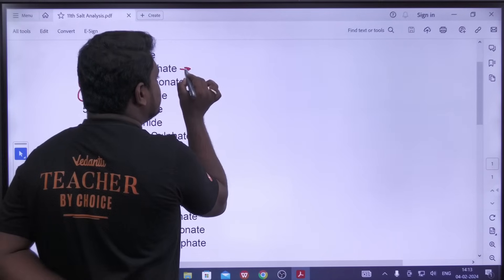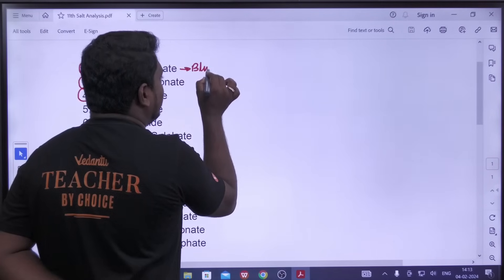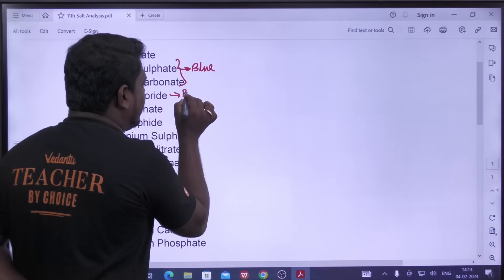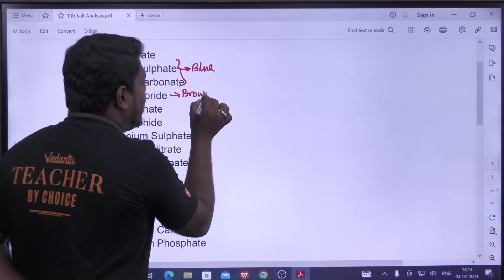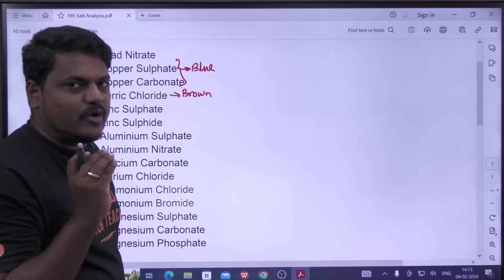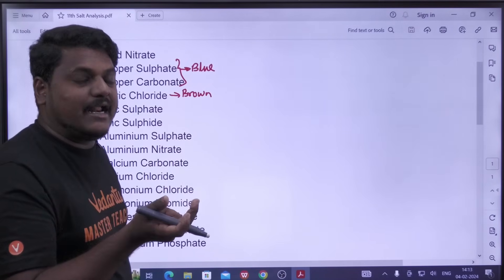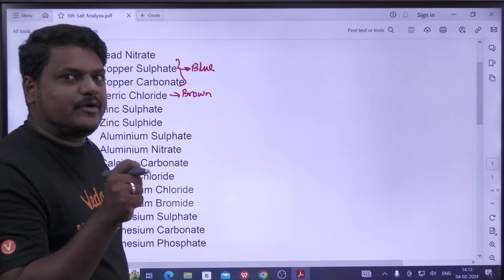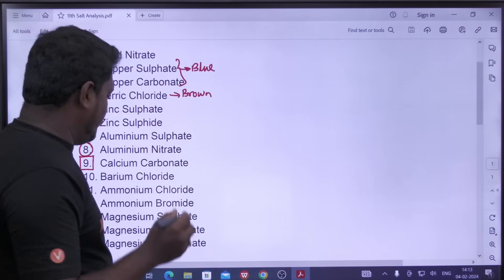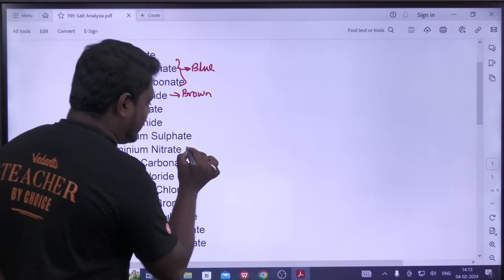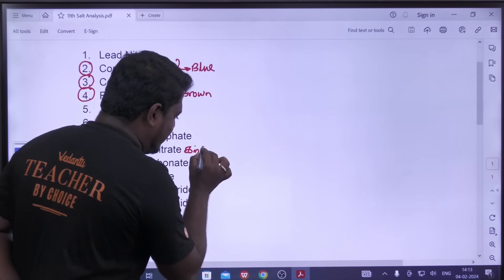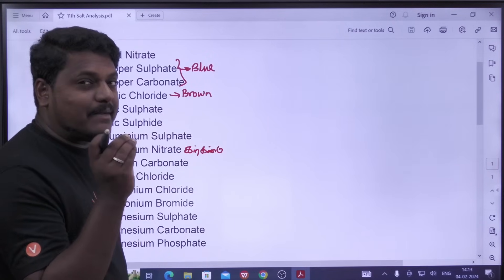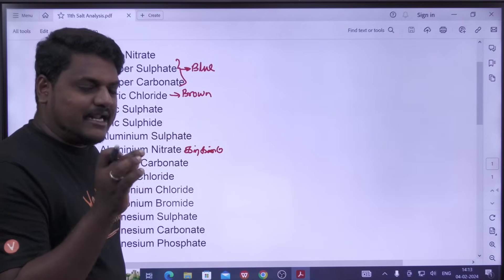Let's look at this circle — what color? This is going to be in blue color. These two are in blue color. If you look at ferric chloride, it's a brown color. If you can put all the salt in a box, it's dry. If you put it in a box, it's brown color. If you look at aluminum nitrate, it's shiny — a little bit.